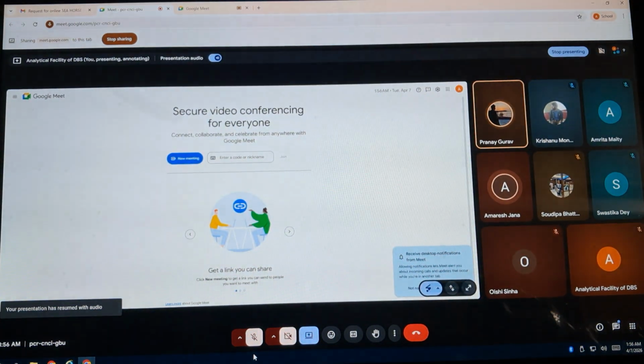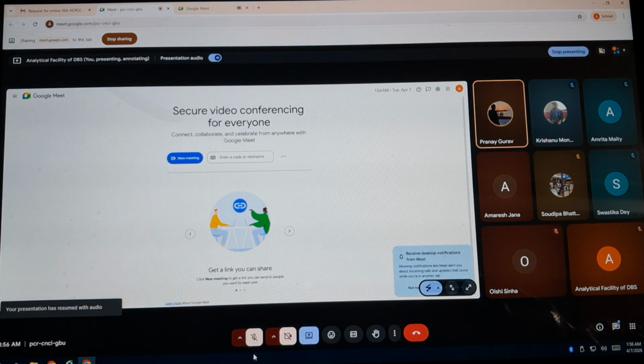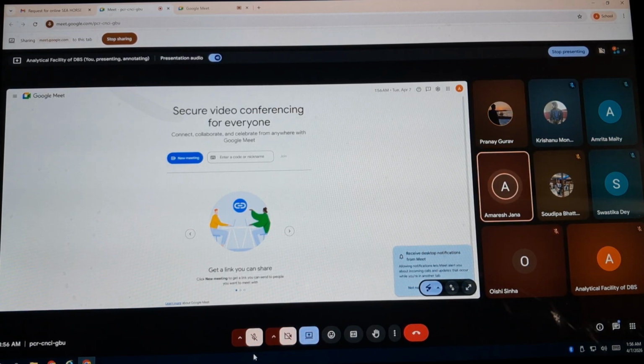I will address the measuring. Is there anything else? One thing: do you have any template regarding this data processing and protocol setup? If you have, you can share it with us. Yes, sir, I do have a manual. Yeah, so you can share it.